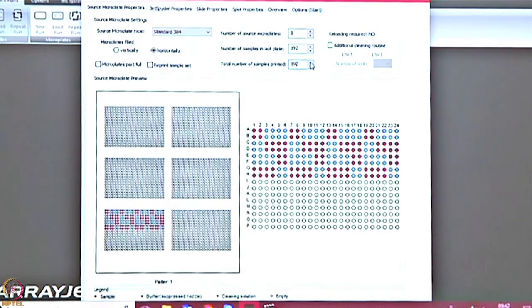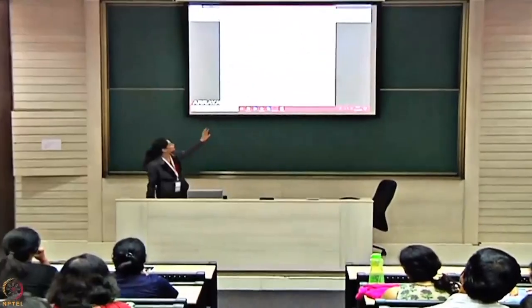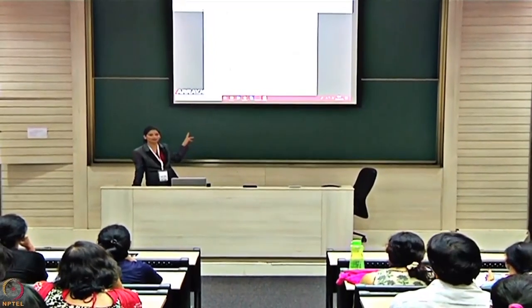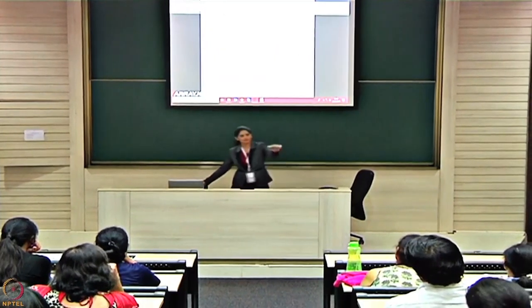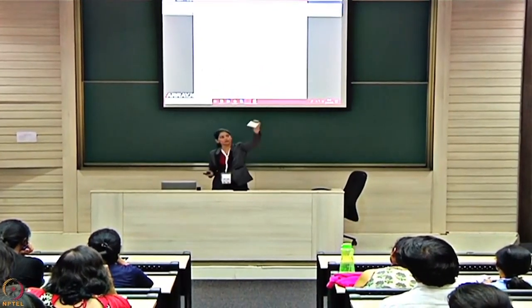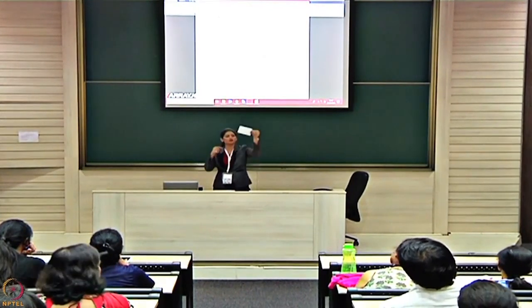So when we are doing assay transfers, we show you a full demonstration of how your assay manually can move horizontally, but this is only to prepare your source plate. This is not how it will look when you print it. This is your 384 well plate. So this is something like this plate. Let me show you. This one. So this is like any plate where you put 20 microliters of sample. Now this feature of the slide shows you where you have to put your sample.